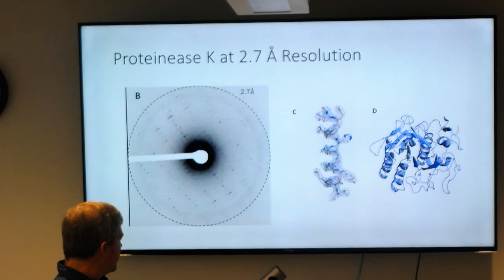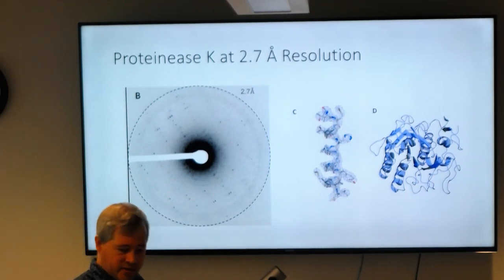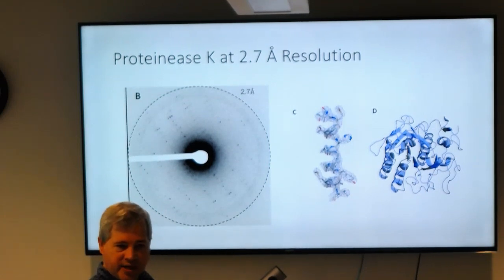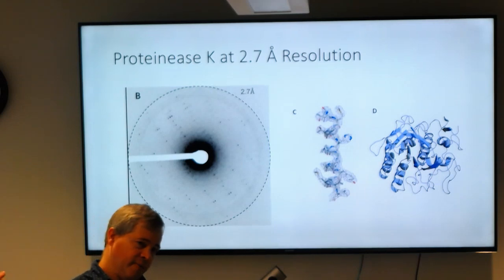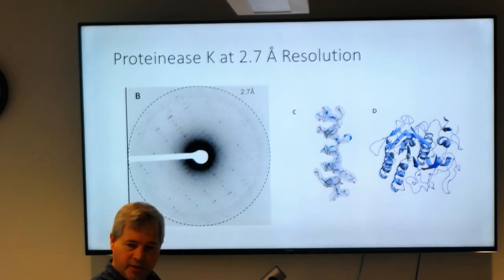This didn't go as high as what they get from the microcrystals, so they suspected perhaps the gallium beam did damage it a little bit. They didn't see any ice diffraction, so it didn't seem to cause recrystallization, but it still didn't go quite as high as they got from the tiniest crystals. But it worked. So if your crystals were a little too big for microED but still too small for X-ray diffraction, you could use this. Obviously this technique has a lot of disadvantages: you need a whole other microscope, and it's a lot of work, but it's a possibility.